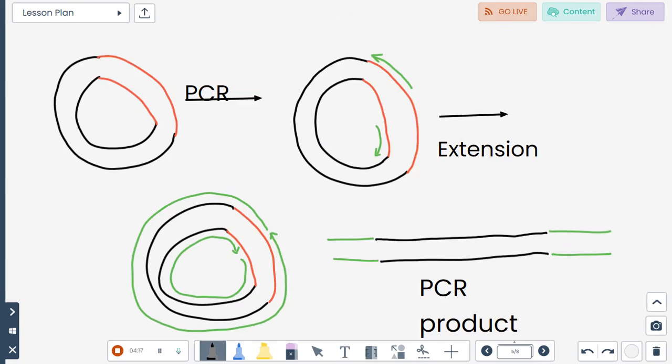Then after that, you do a PCR. When you do the PCR, you know the sequence of the transposon sequence on the right side of the restriction site that we have used. Based on that, you can design two primers, and these two primers should not have any base complementarity or overlapping. You prepare a forward primer and add it to the reaction, and also prepare a reverse primer and add it to the reaction.